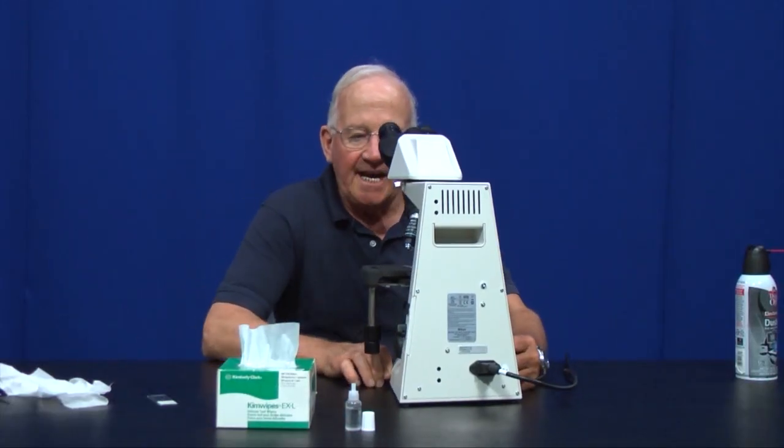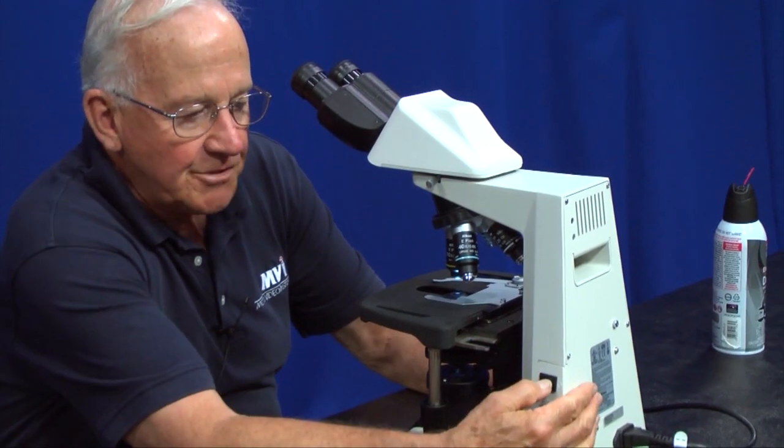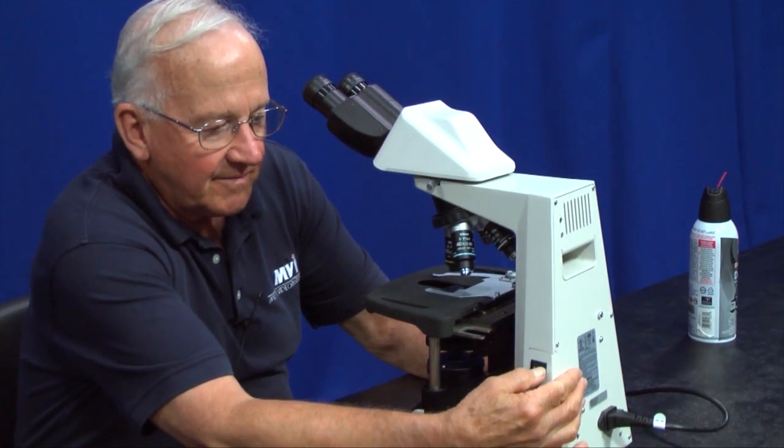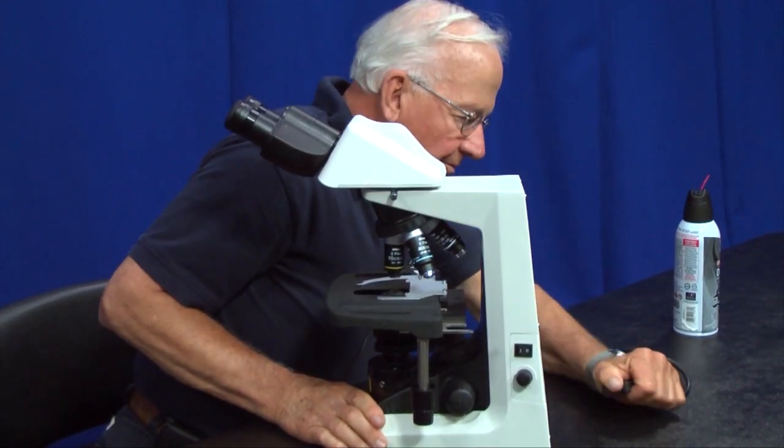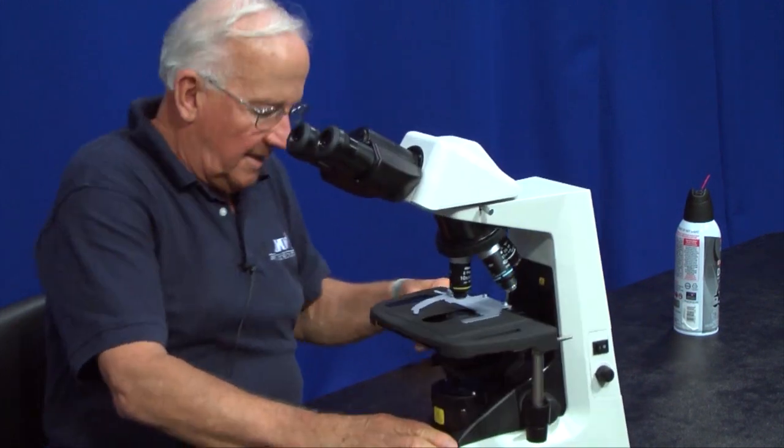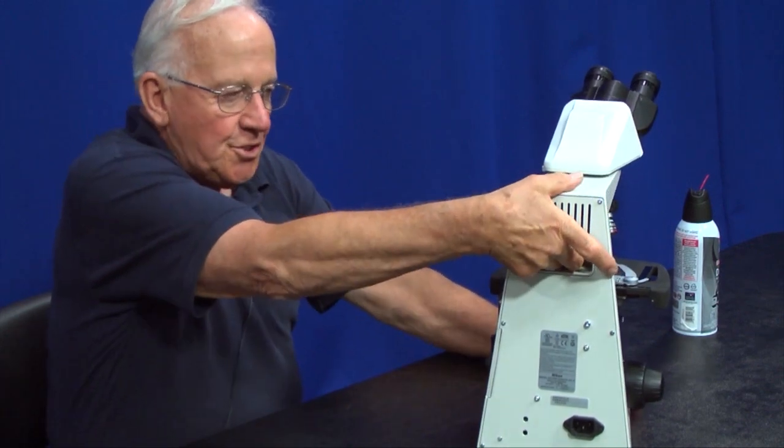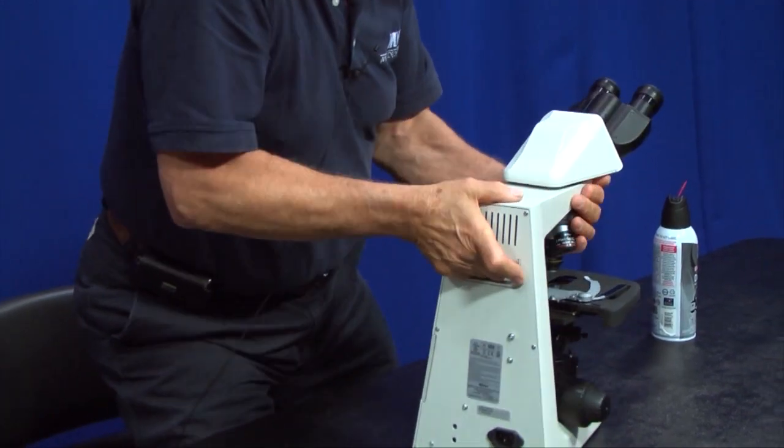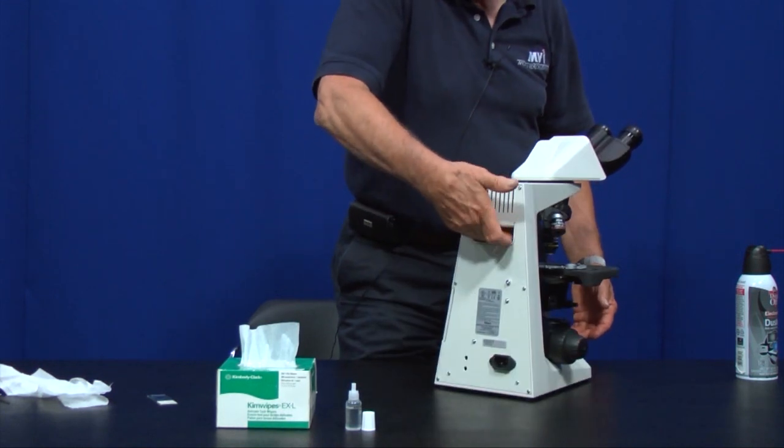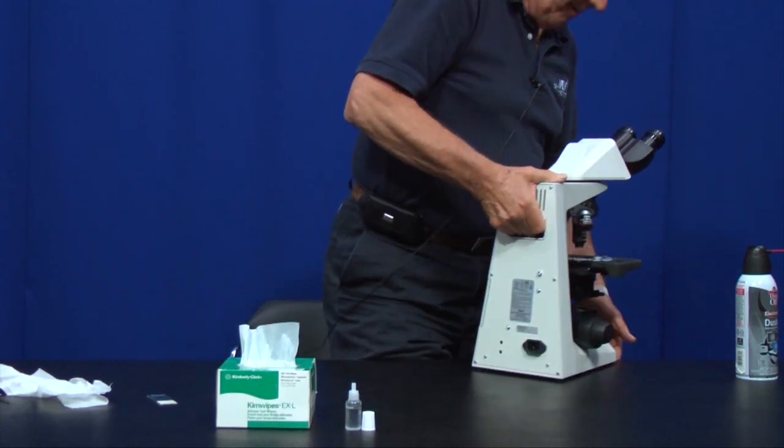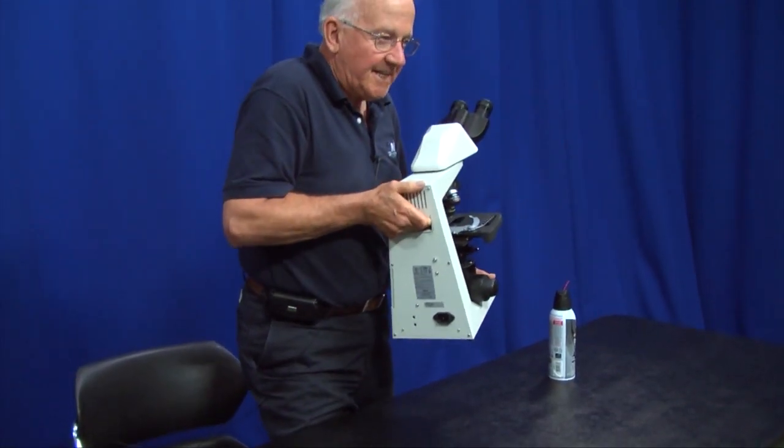Now that I'm through using the microscope for today and we're going to store it perhaps in a cabinet, simply turn the microscope off and unplug it from the back. The microscope comes with a built-in recession here which is used for carrying the microscope. Pick up the microscope with one hand in the rear in this indentation and put the other hand underneath the microscope in the front and carry it this way. Always carry it with two hands.